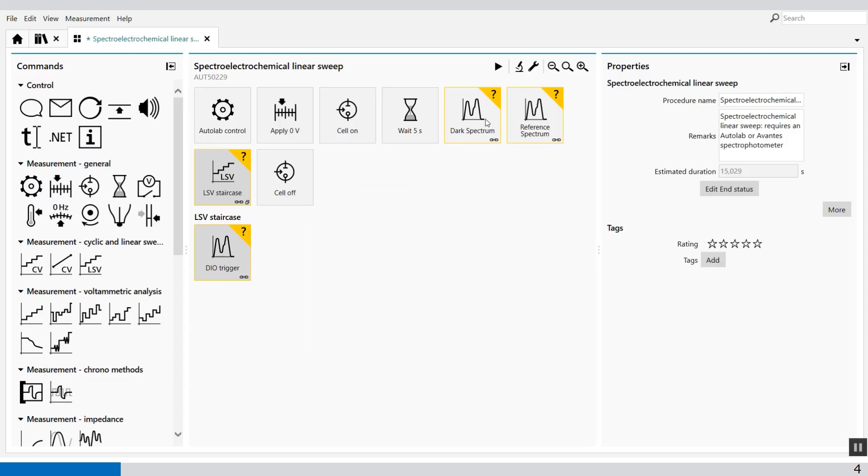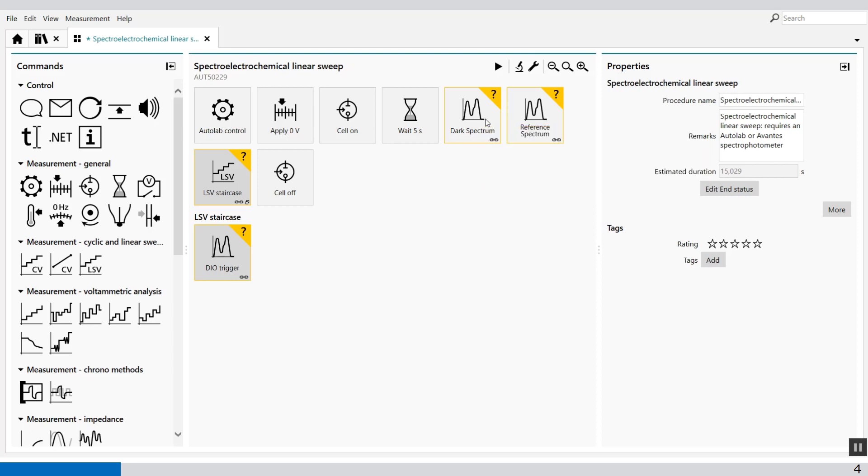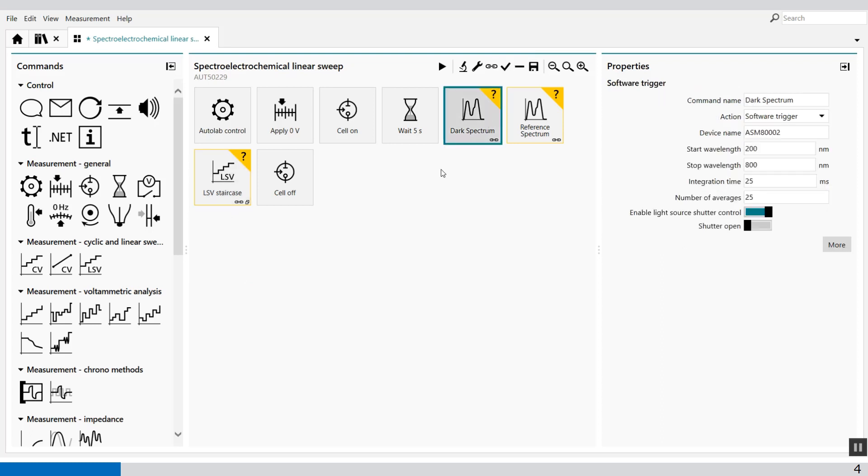Now you see warnings and these warnings show that the requested wavelength range is partially out of the device range because this spectrophotometer has a different range than the 800001. But I'm only interested in a specific wavelength range.